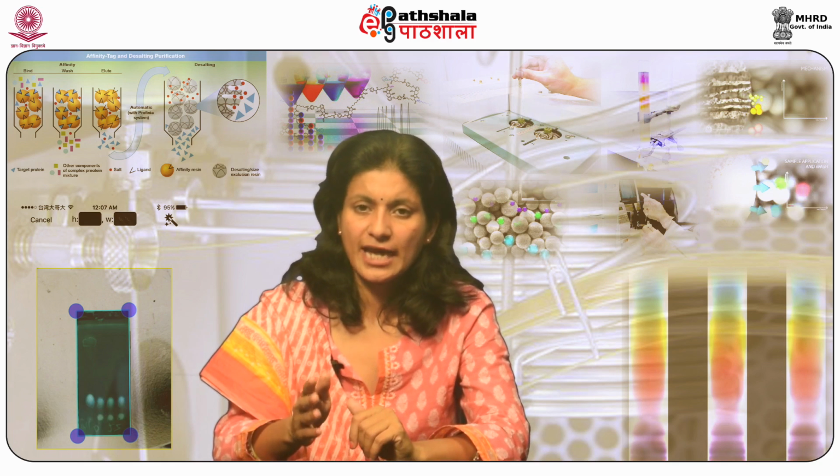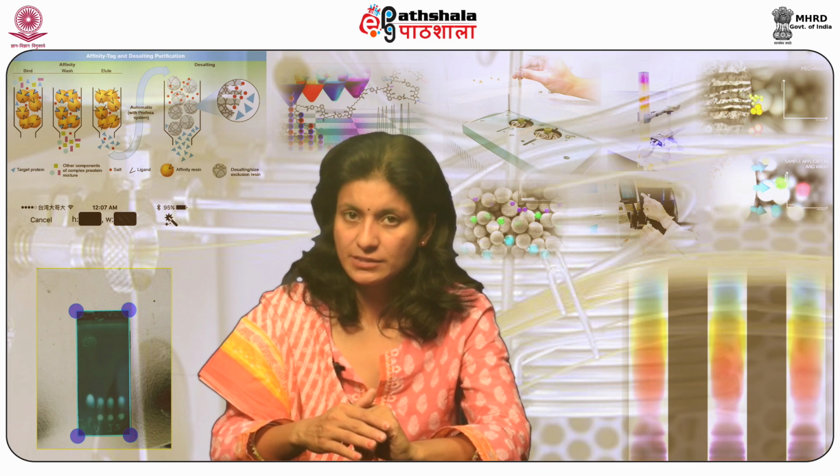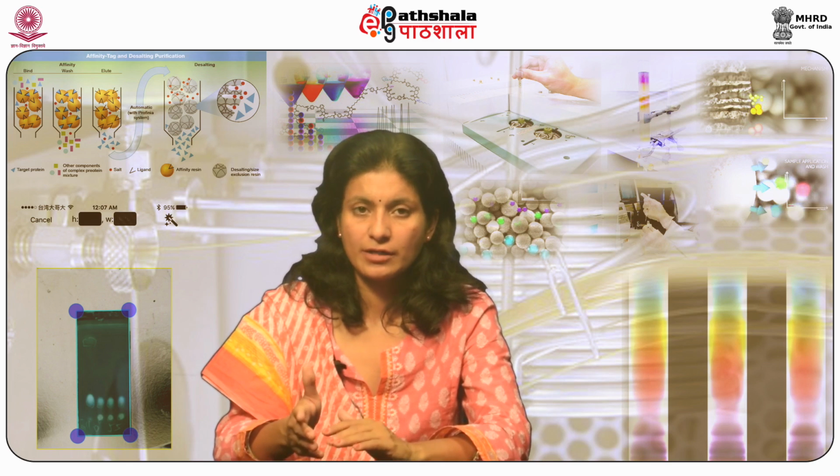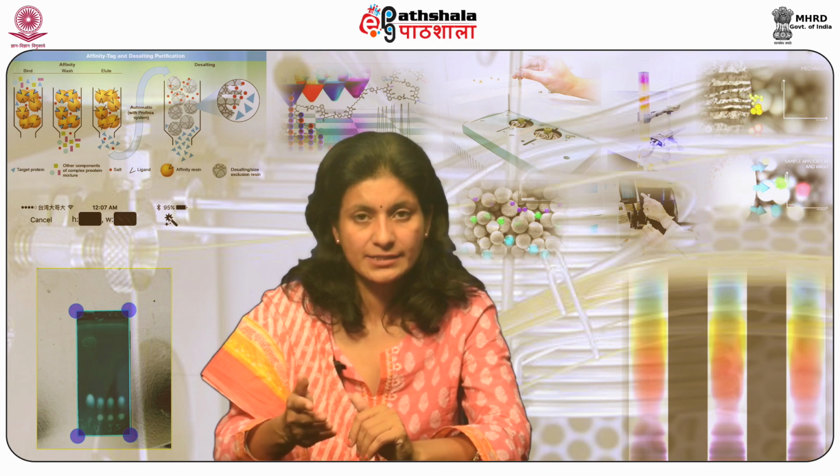Similar technique can be utilized for fluoride and sulfide in solid samples. Acid digestion is best for the preparation of samples which are to be evaluated for cations utilizing IEC technique.